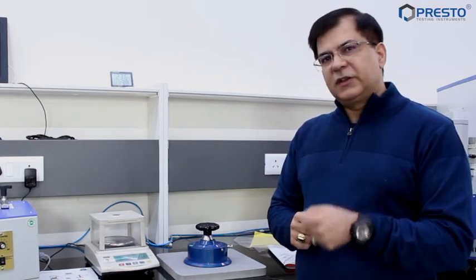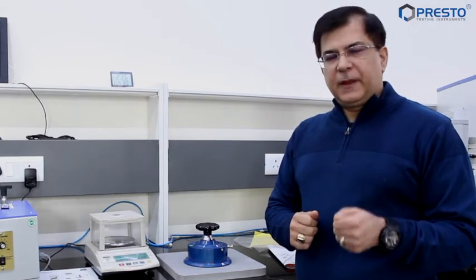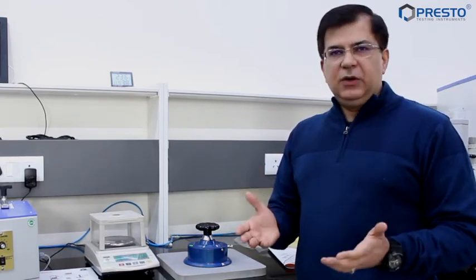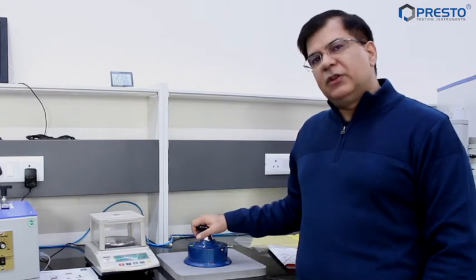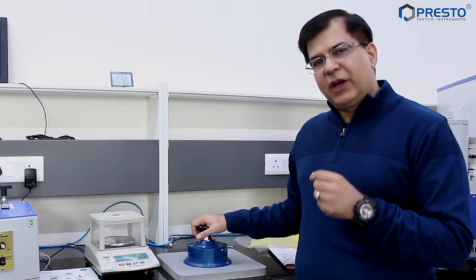Yet it is the most ignored product, not because it is simple but because people don't feel the value of it. In fact, this is the product which I would always call the basis of how you calculate your cost, be you a corrugator or a laminator. The grammage testing kit is the most important thing that you need to have in your lab.